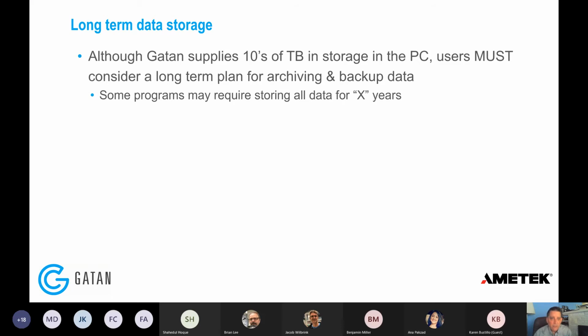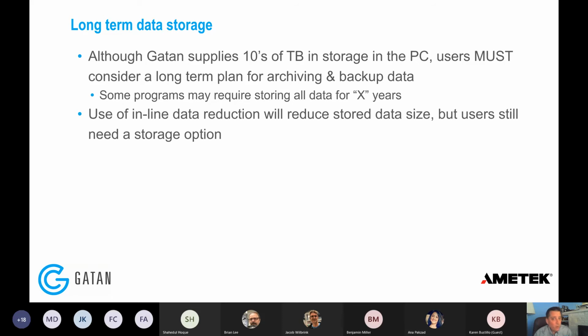Mentioned briefly long-term storage. We do supply tens of terabytes in the storage, but again, it's not a long-term solution. Some facilities or programs or research grants may require storing all data for X number of years. So that's something to consider when you set up your whole system.